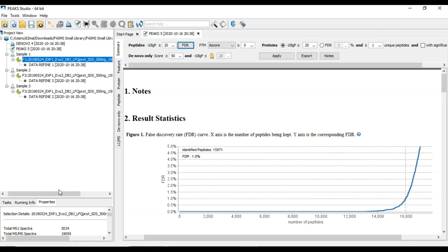This data set is actually a DDA data set, which is being used to create a spectra library. In PEAKS, you can create a spectra library from any DDA data set with a PEAKSDB identification result.